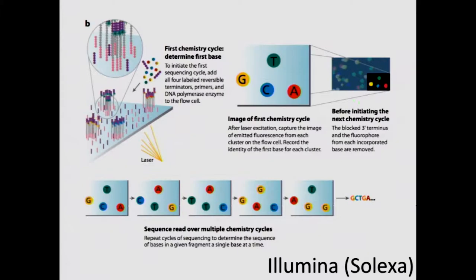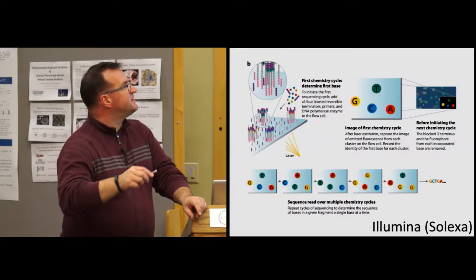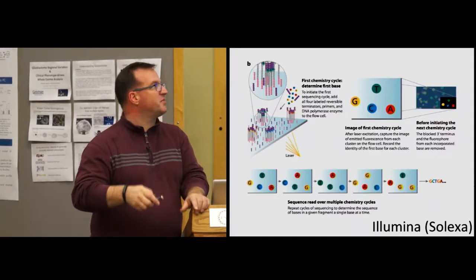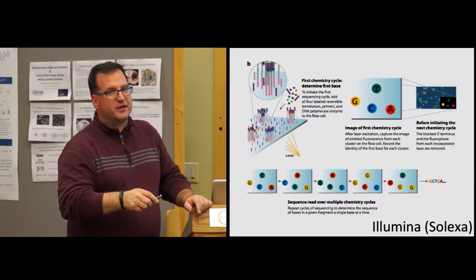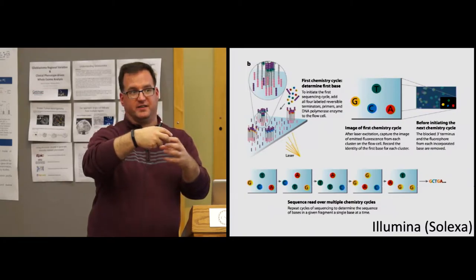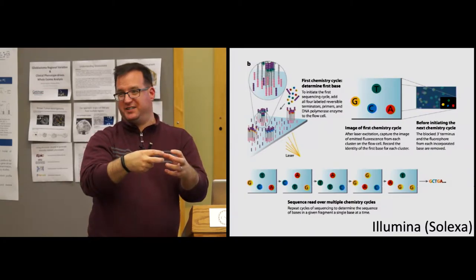So we float in one, we snap a picture of it, and the fluorescence tells us which residue got incorporated at that particular cycle. So now we can watch the polonies from cycle to cycle, and for any one given polony, we can read off the sequence. This was yellow, so that was G, then it was C, then it was T, then it was G, then it was A, and that gives us the sequence. Okay. So this is a somewhat idealized picture here. You can actually tell up here, again, just like a bacterial plate or a yeast plate, sometimes the polonies are very close to each other. Sometimes you can have a colony that grows really big and kind of blebs off and looks maybe like it's another colony, but it really actually is the same colony.